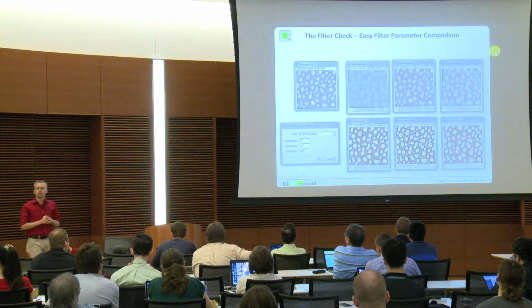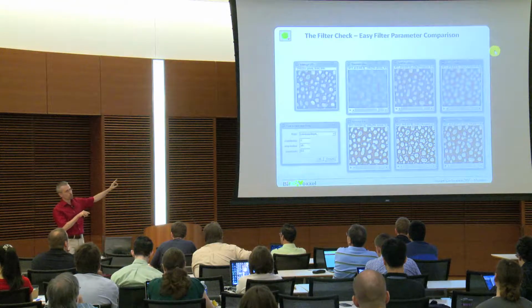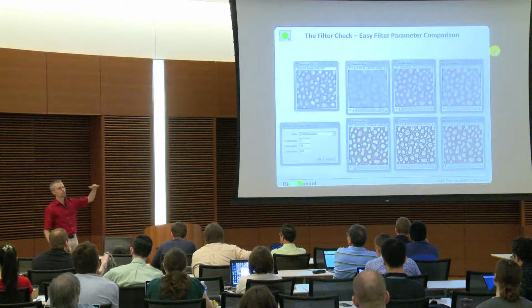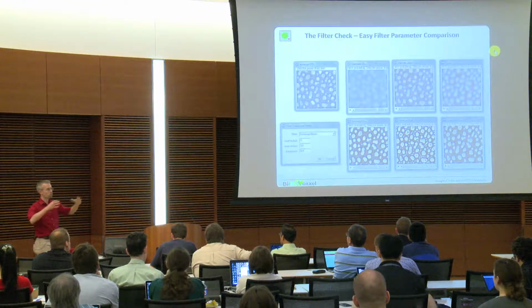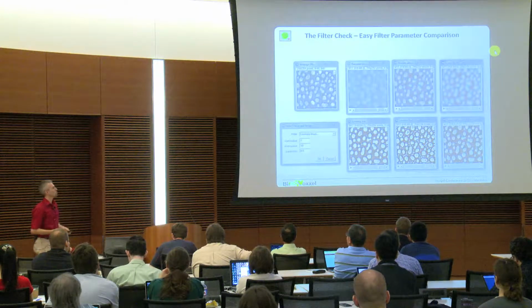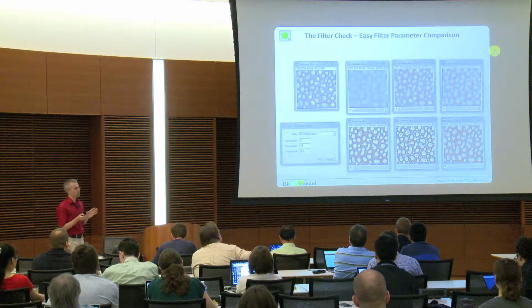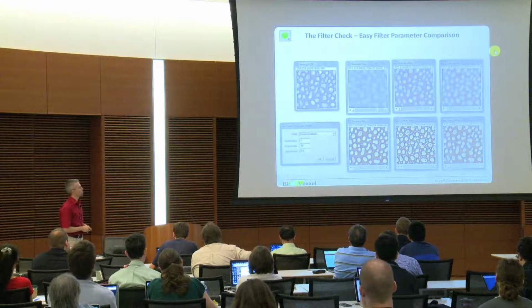That means that ImageJ will show you then later on a stack, and every slice has the first one as the original, and every slice after that uses one step more of the radius, so it gives you basically an option to zoom through higher or lower filtering of the image and compare that to find best the filter options you might want to use afterwards.